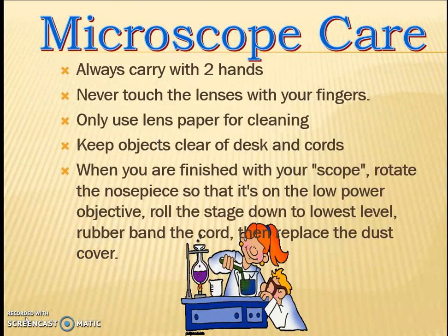Roll the stage down to the lowest level, and rubber band the cord when you place the dust cover. When you are done, take care of all these precautions and that's going to save the microscope for further usage.